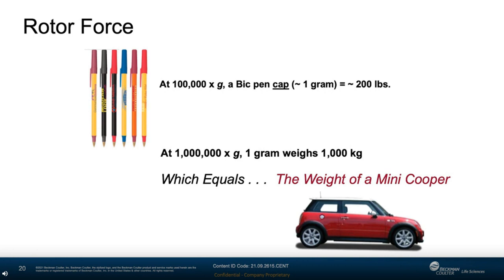Even these don't generate the forces involved in floor model centrifuges. The forces involved in centrifugation are not within our experience, and so it's really difficult to imagine. Be sure that you get training, because what applies to a microfuge, like balancing tubes by eye, is not how to work with other centrifuges.